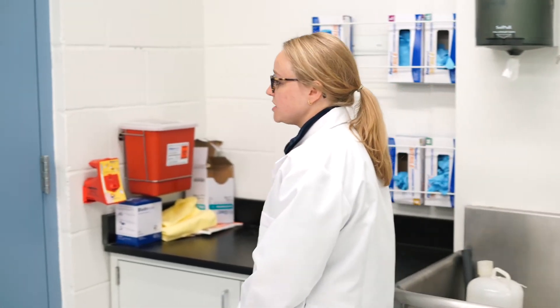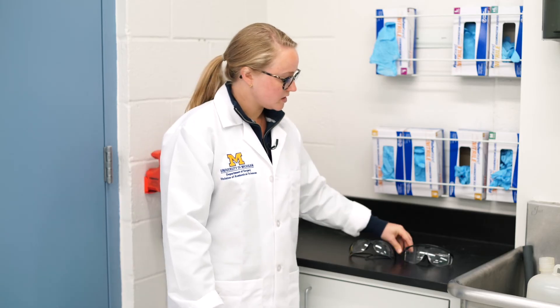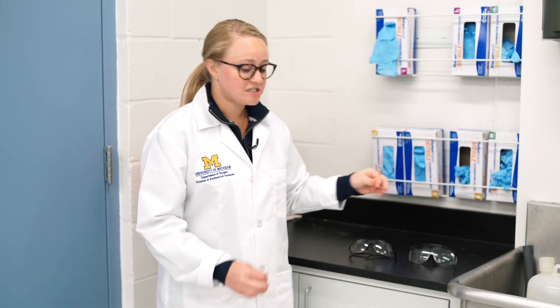Prior to starting in the lab, please always remember to wear your lab coat, long pants, closed-toed shoes, gloves, and safety glasses. We have a standard pair and an over-the-glasses pair provided for you. We suggest that if you have long hair to go ahead and tie it back.